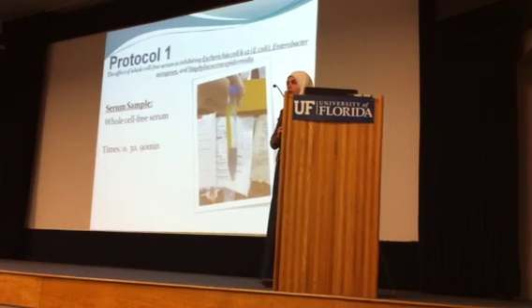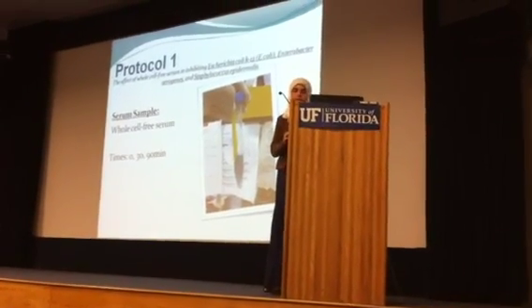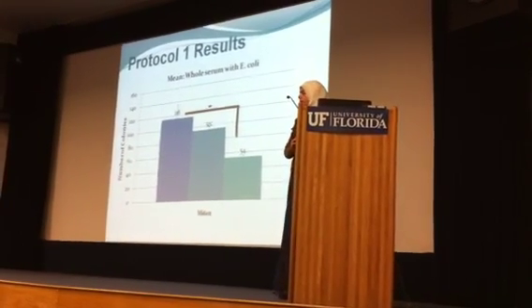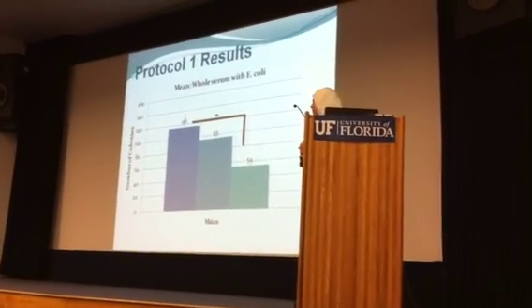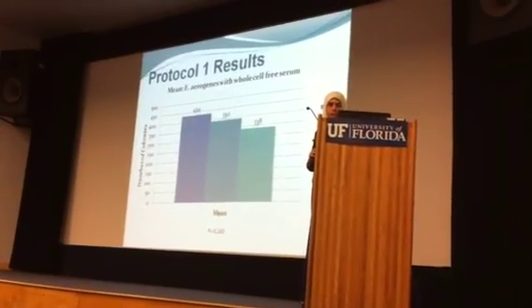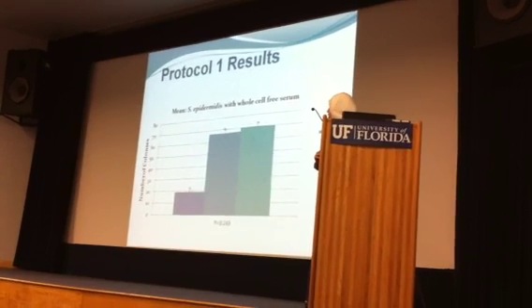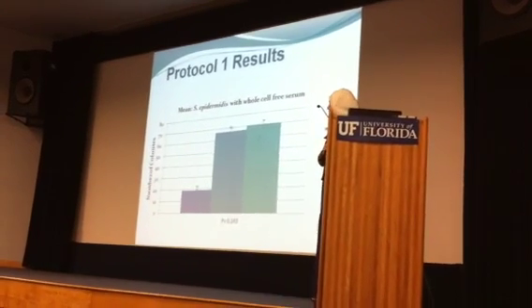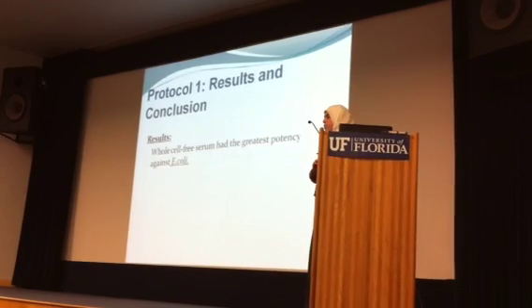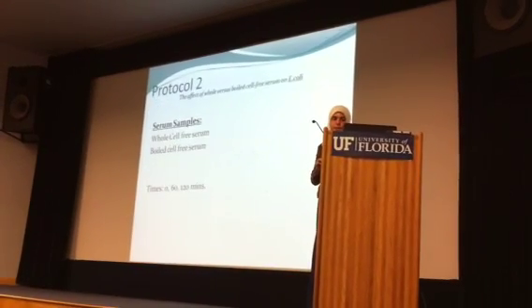So for my first protocol, I was using whole cell-free serum against E. coli, Enterobacter aerogenes, and Staphylococcus epidermidis. And as you can see with E. coli, between 0 and 120 minutes, there was a significant reduction in the number of bacterial colonies. However, with Enterobacter aerogenes, very little inhibition was observed, and with Staphylococcus epidermidis, there was an increase in the number of colonies. So I could conclude that there was most potency against E. coli, so I would use E. coli for the remainder of my experiment.